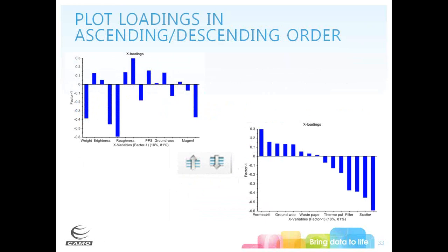We've also added the ability to plot your loadings in ascending or descending order by using arrow bars in the toolbar.